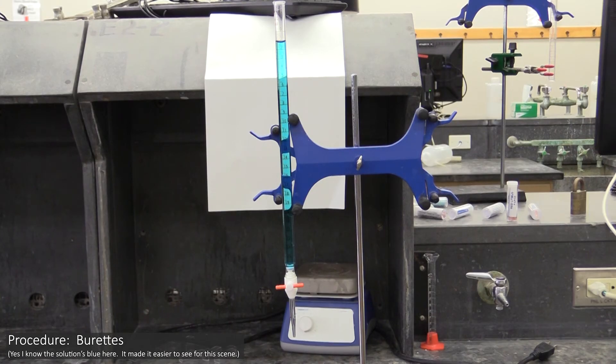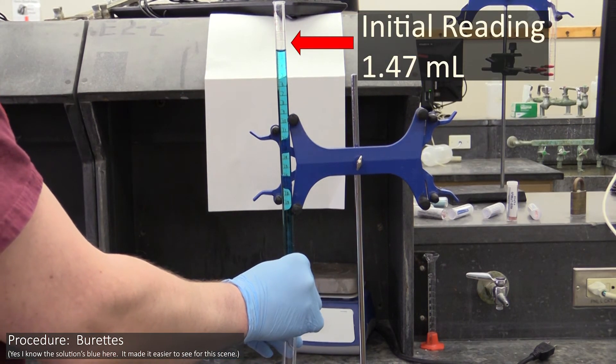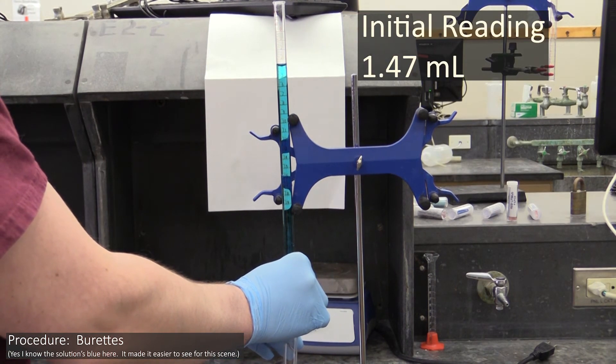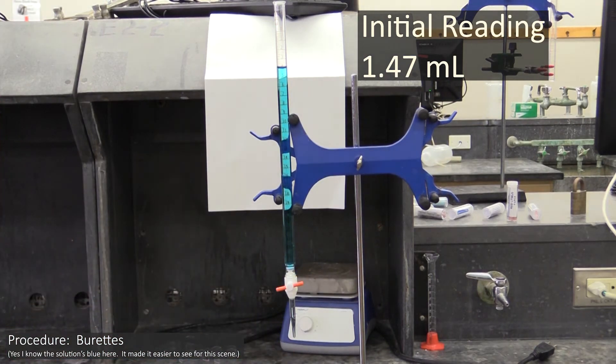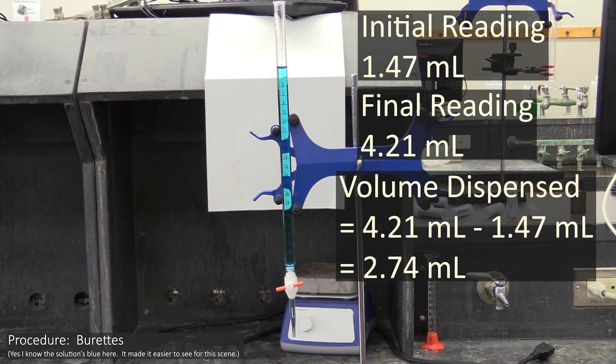To determine how much fluid you've dispensed from your burette, you will first take an initial reading to the hundredths place by interpolation. After you have dispensed what you need to, you will take a final reading and calculate the volume dispensed by subtracting the initial reading from the final.